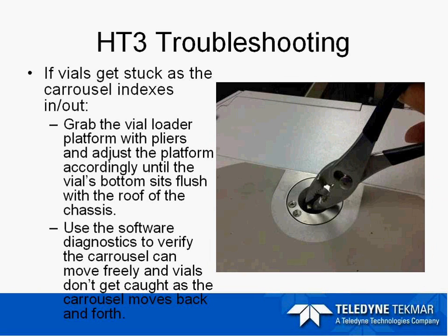A common issue is when the carousel indexes between positions 30 and 31 — sometimes we get an index error or a vial gets stuck. This is when it transitions from the outer ring to the inside ring. Sometimes you just need to pull up a little bit on the vial loader foot to help it clear and move back and forth more smoothly.